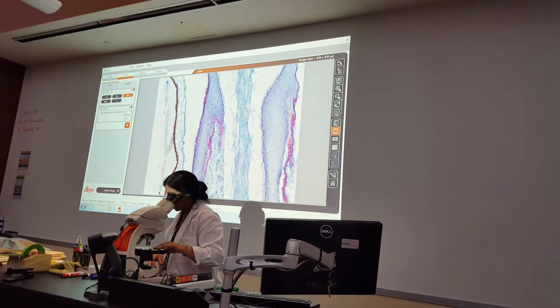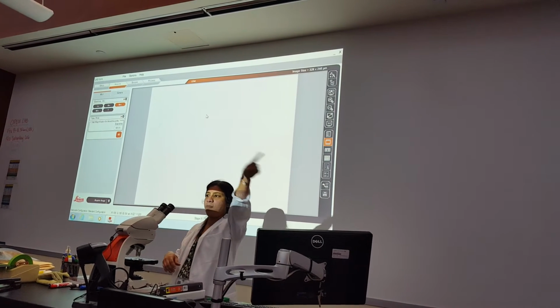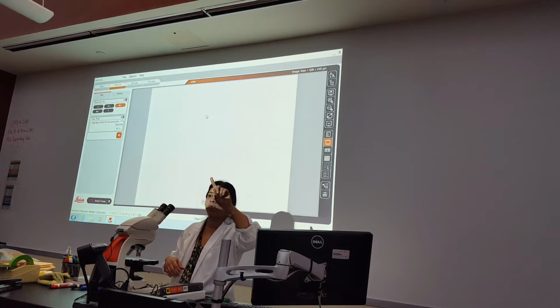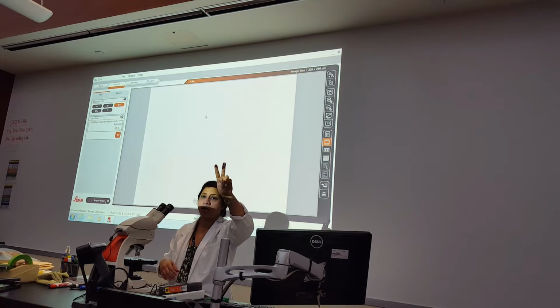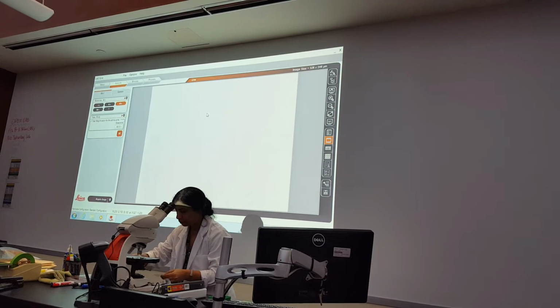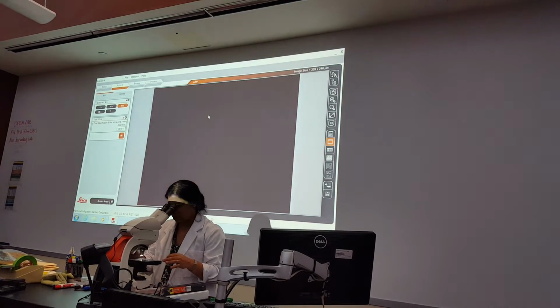That's the moss. Now, so the moss story is done. So we did Marchantia, we did moss. Then what were the other slides you saw? Did you see any slides for Equisetum? No. Did we see any slides for Psilotum? No. We saw two slides for Selaginella and Lycopodium, right? Let's do those. Tell me, homosporous or heterosporous? Homo.